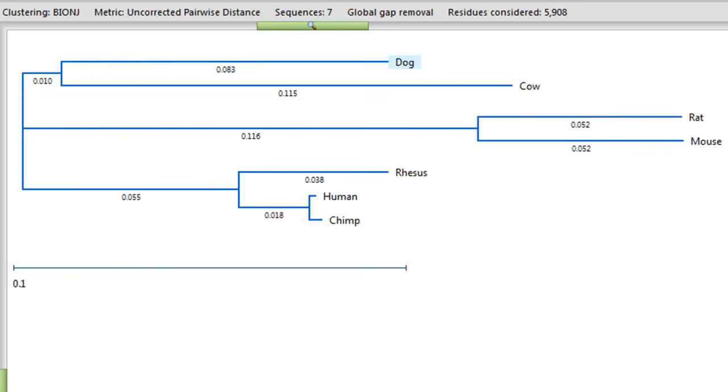As you can see, the phylogenetic tree graphically illustrates very plausible evolutionary relationships for the seven species.